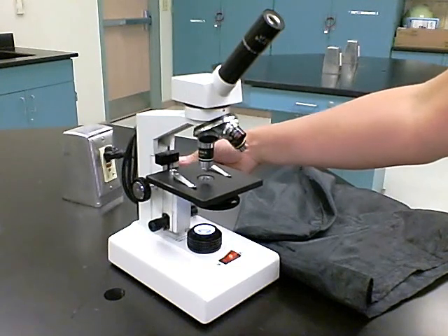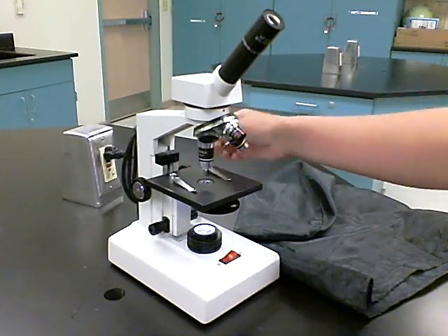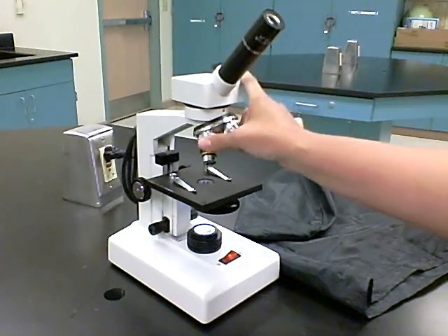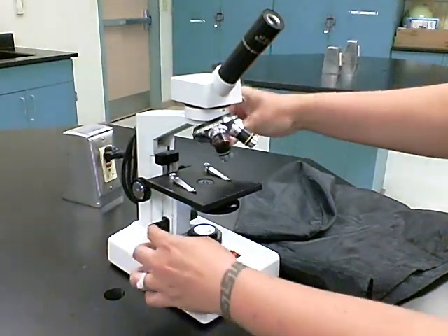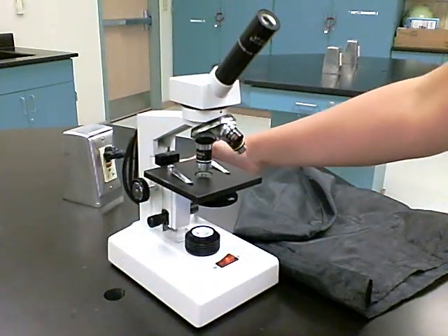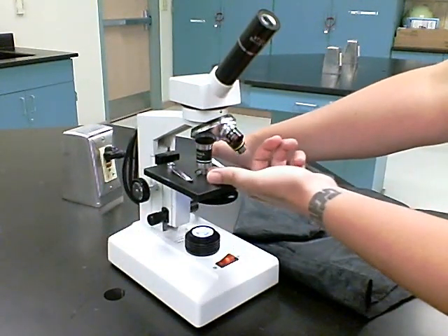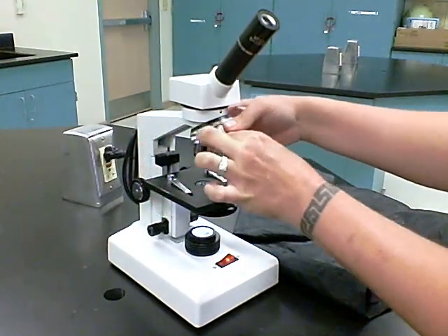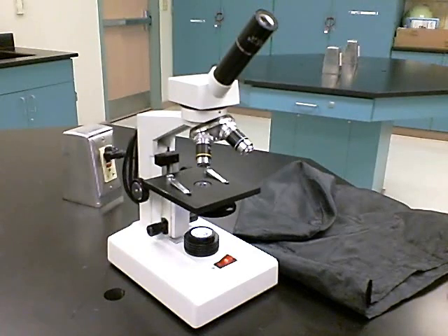Using the coarse knob, you want to bring the stage to the lowest position, as well as place the lowest objective lens in position. And what that does is it will keep you from scratching your lens. If you put it away with the highest objective in and the stage up, this will actually scratch your lens. So to keep from doing that, you want the stage all the way down and the lowest objective in place.